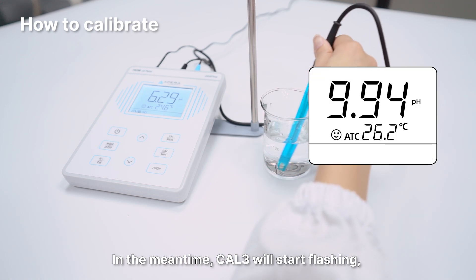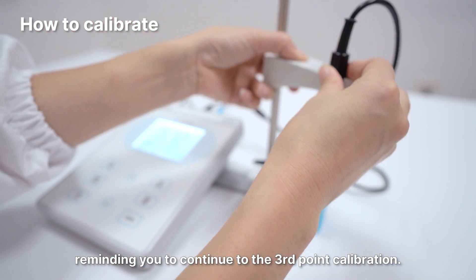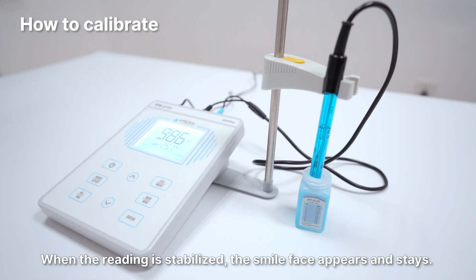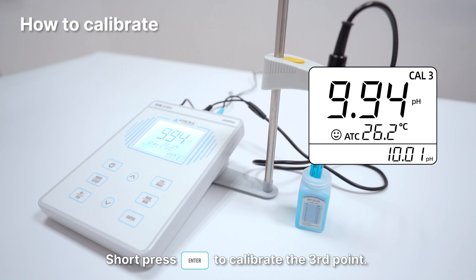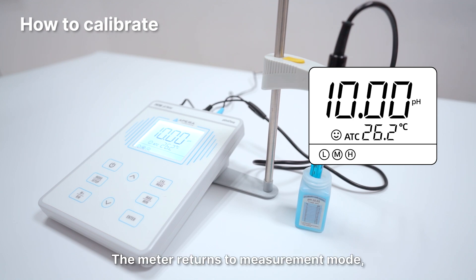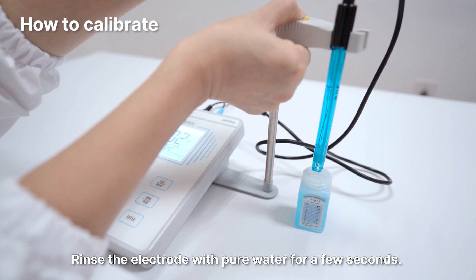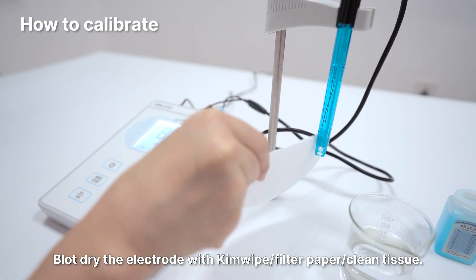Cal 3 will start flashing, and 10.01 pH will flash at the lower right, reminding you to continue to the third point calibration. Use 10.01 pH buffer and repeat the calibration procedure again. When the reading is stabilized, the smile face appears and stays. Short press the Enter button to calibrate the third point. The End icon and the electrode slope of the alkalinity range will display after calibration is finished. The meter returns to measurement mode, and the calibration icons L, M, H will show up, indicating the low, medium, and high points are all calibrated. Rinse the electrode with pure water for a few seconds and blot dry with kimwipe, filter paper, or clean tissue.